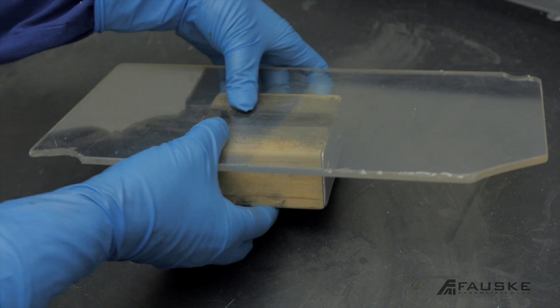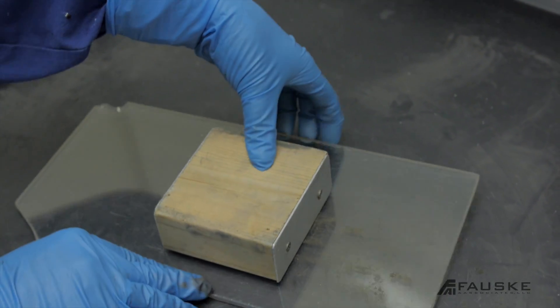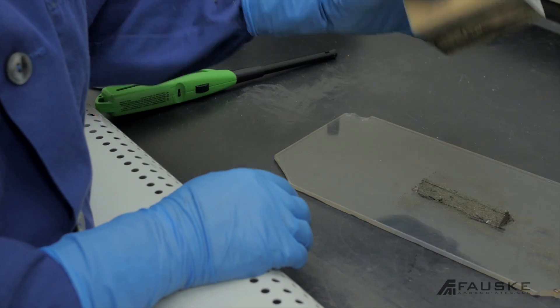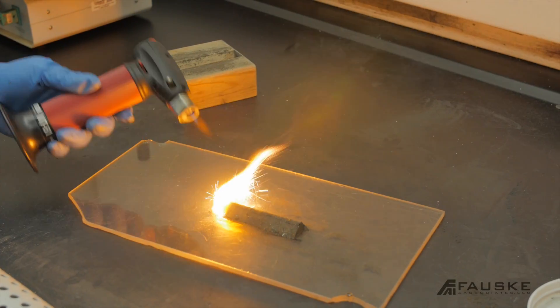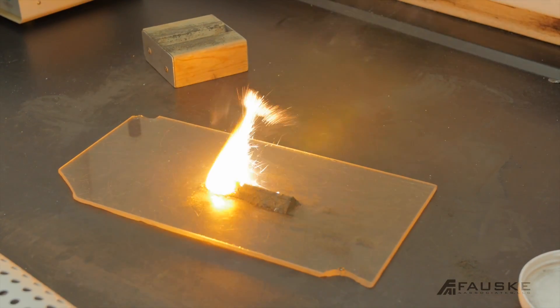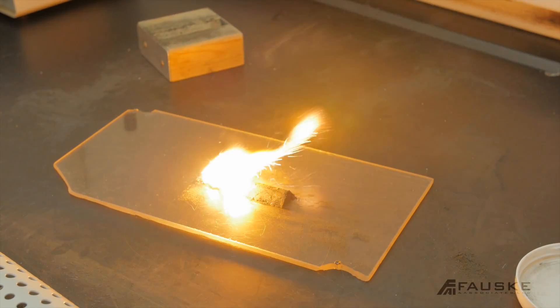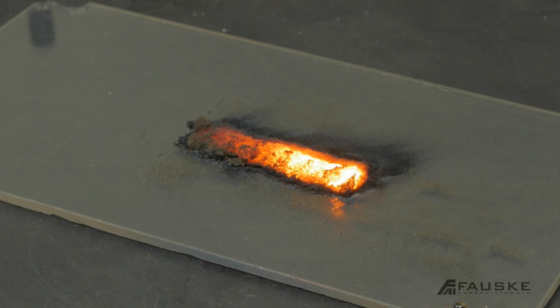The other portion of the screening package is the combustibility screening test. This will determine if the material will support a flame while in a pile. If your facility has hot atmospheres from ovens or heavy machinery, this is a good test to consider. Keep in mind, even with the no-go result of your explosibility test, you may still have combustion concerns.